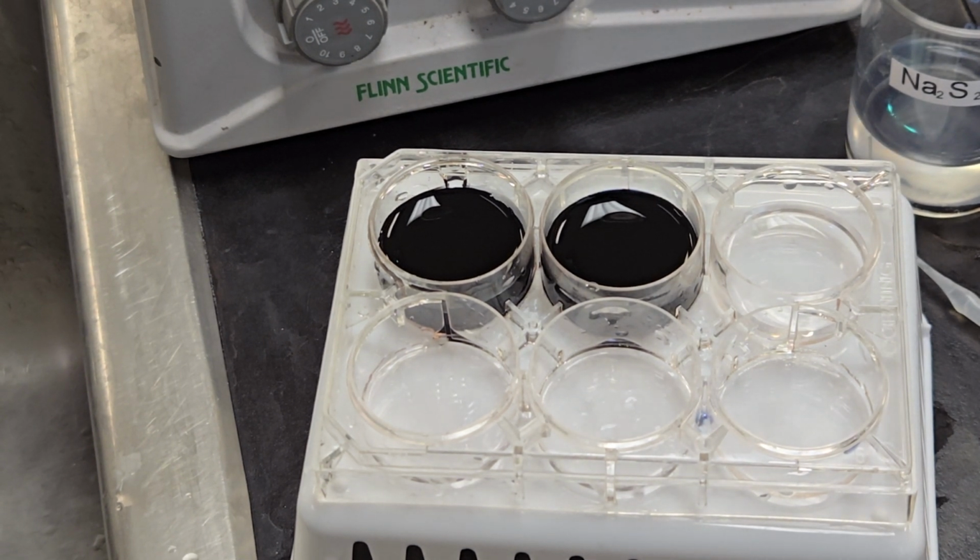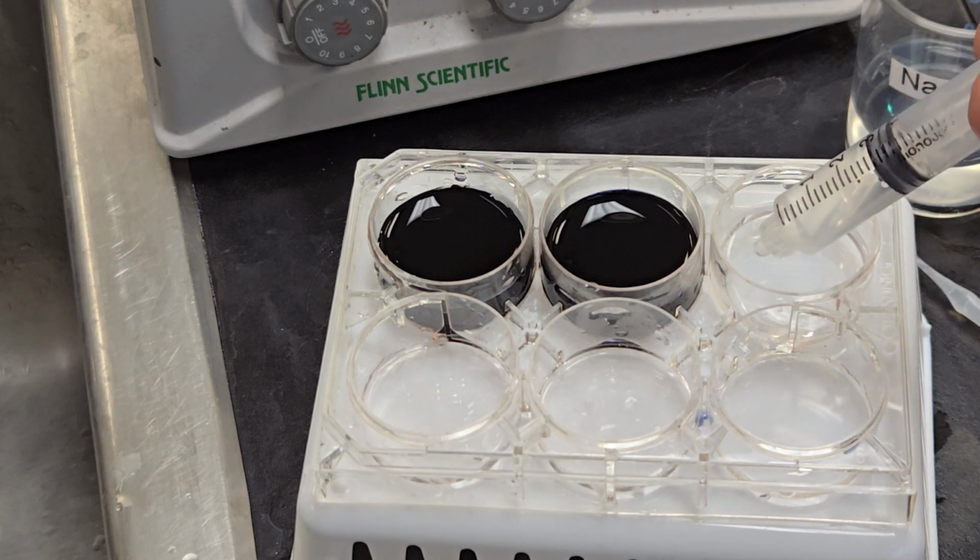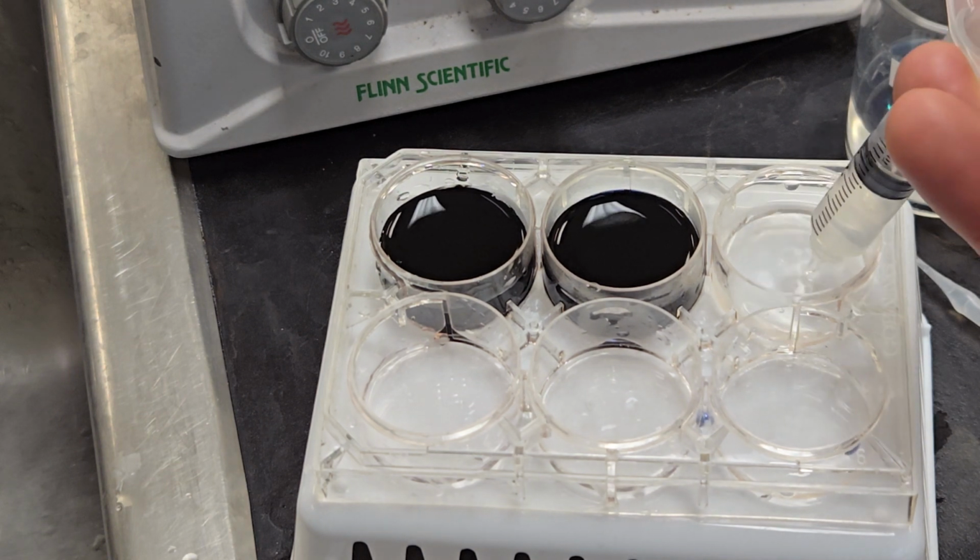Hot went faster than room temperature. So what will happen with cold compared to room temperature and hot? Here we go. Cold potassium iodate. Start your timer now.